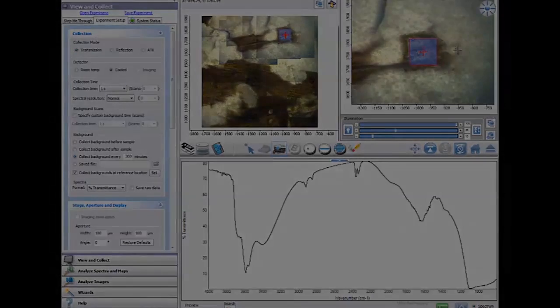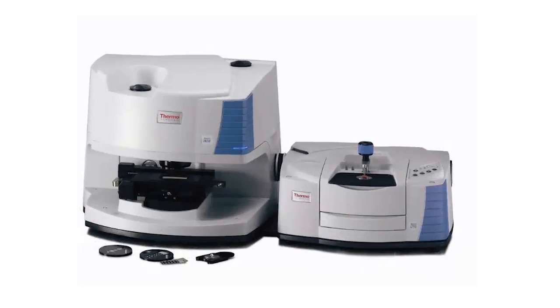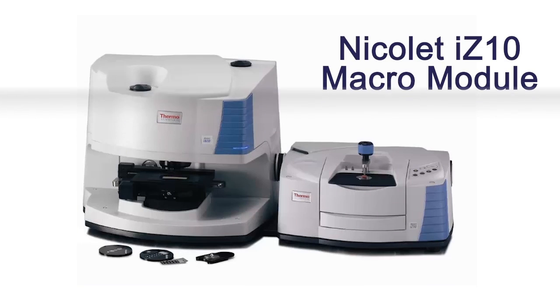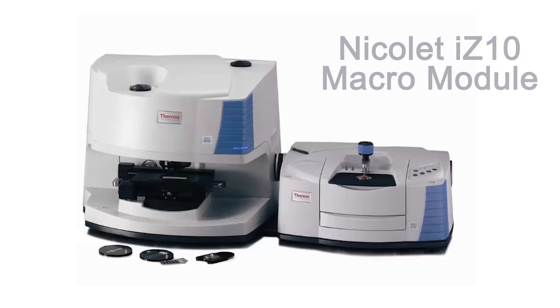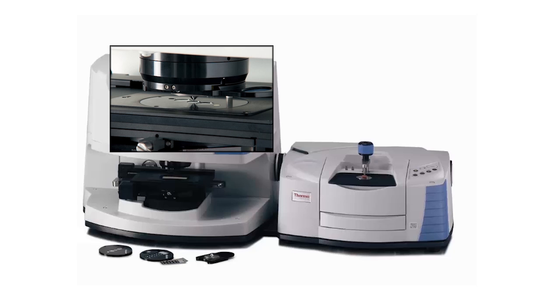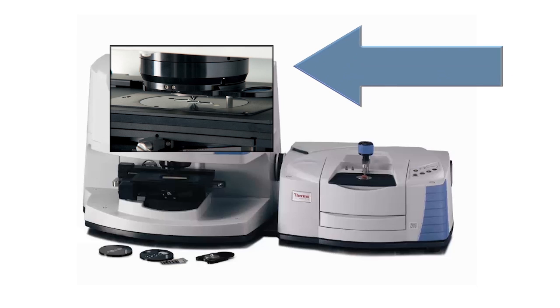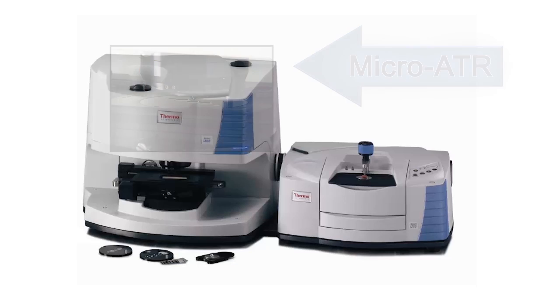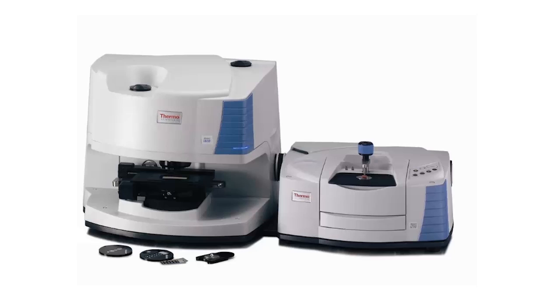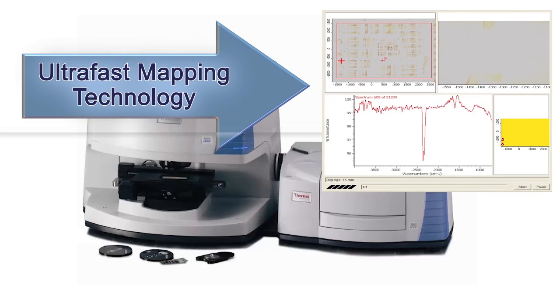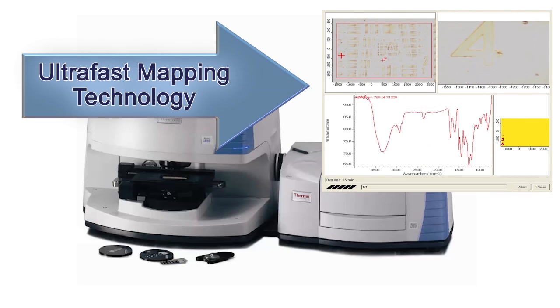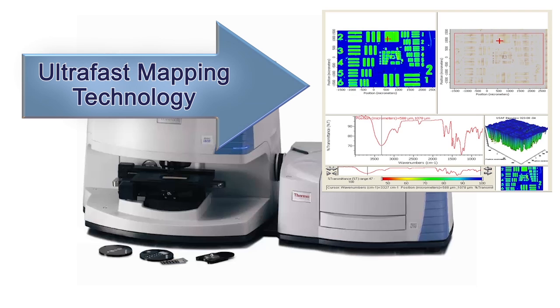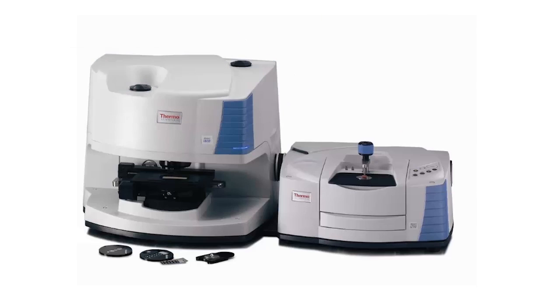You can expand the capabilities of the IN-10 microscope system with several options, including the full-size IZ-10 microsampling module that accepts any Thermo Scientific or third-party accessory. The high-performance micro-ATR allows direct contact sampling, solving many sample preparation challenges. And the IN-10 platform supports chemical imaging options using both single-channel and multi-channel detectors with its ultra-fast technology.